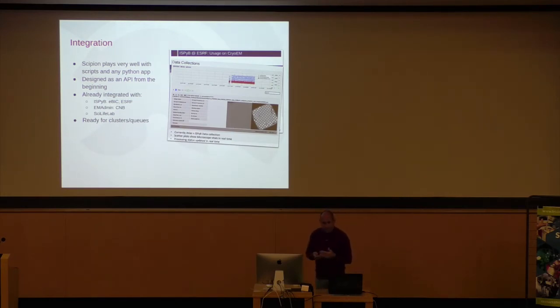Scipion is already designed to play well with clusters and queues. So you can configure Scipion to work with different queue engines. If you have a cluster and you want to send jobs, Scipion is ready and able to do it.